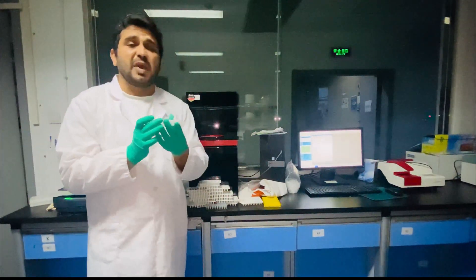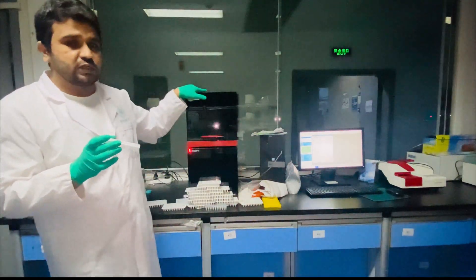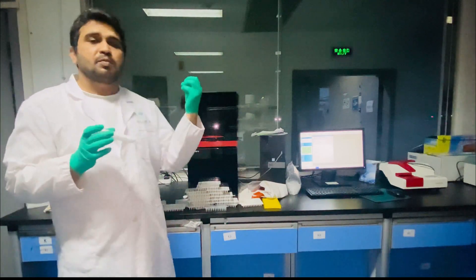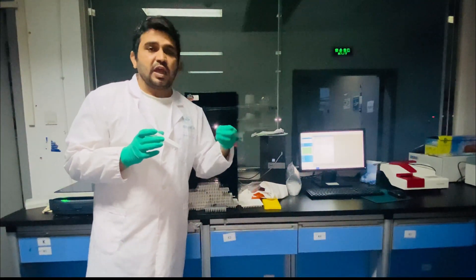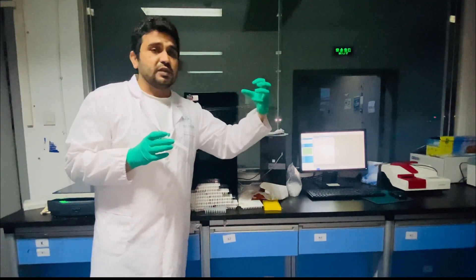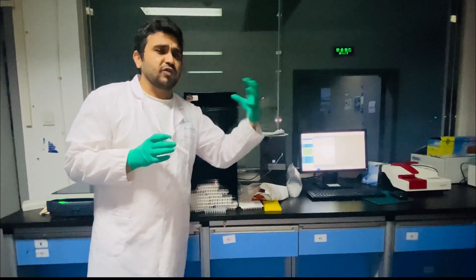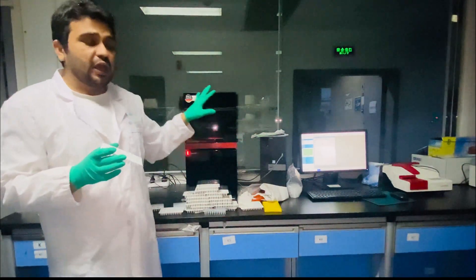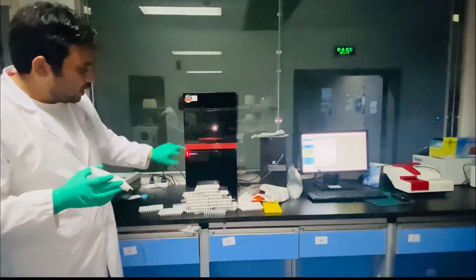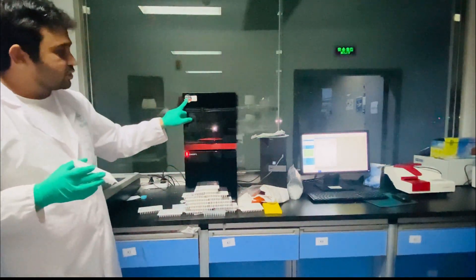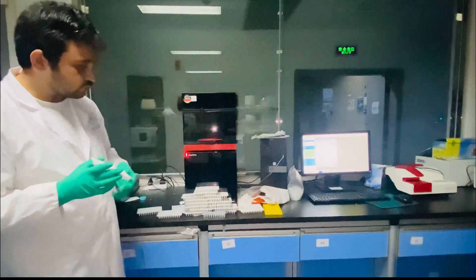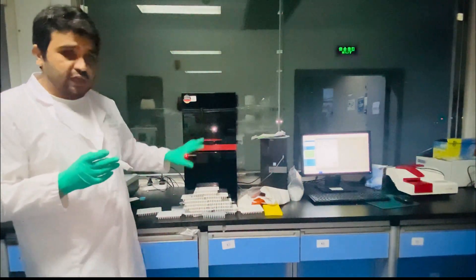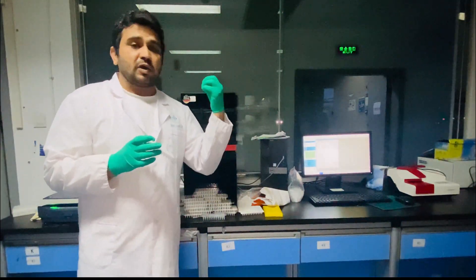There are many guidelines to use this qPCR machine. We know that the PCR machine was invented by Kary Mullis in 1983 and 84, and then there were changes and few new advancements were brought into this machine. Finally this version is Q Tower 3G. We purchased it from Germany. We can see here it is written Made in Germany. This is a tower and there are different types of qPCR.